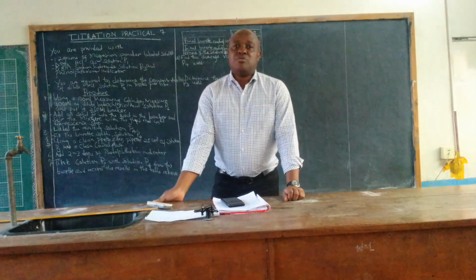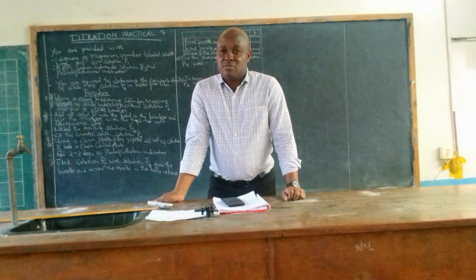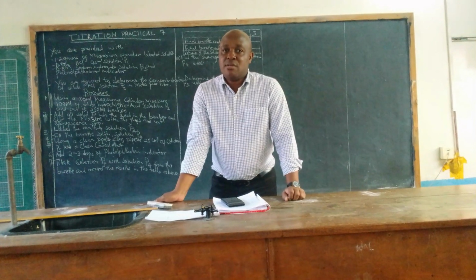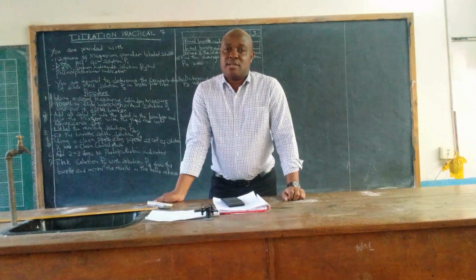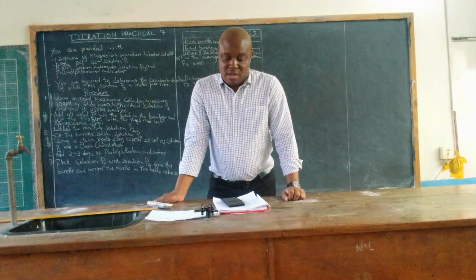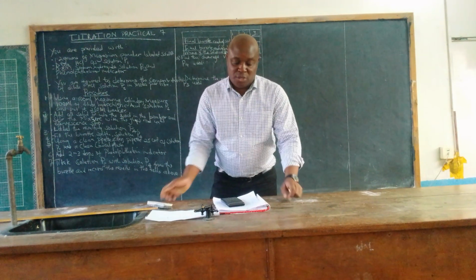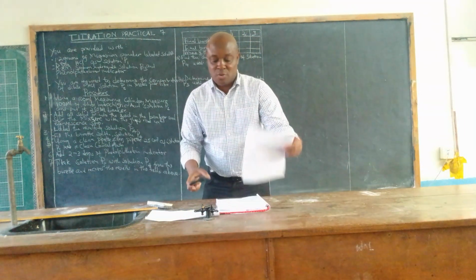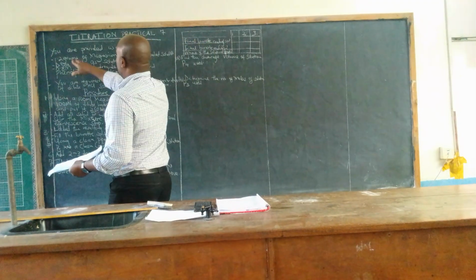Today we are just going to continue with our series of titration, and currently we are on titration 7 in as far as the series of titrations is concerned. So we are just going to do a few questions here, a few questions in the mole concept. So we are just going to go through the procedure.